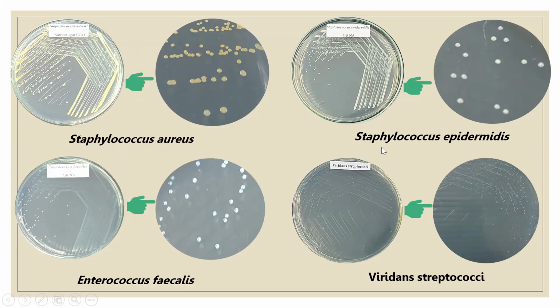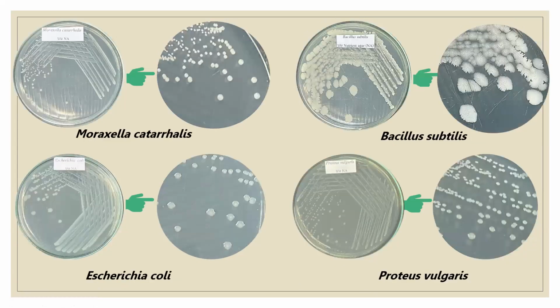Here is the colony of Staphylococcus epidermidis, Enterococcus faecalis, viridans streptococci, Moraxella, Bacillus subtilis, Escherichia coli, and Proteus vulgaris.